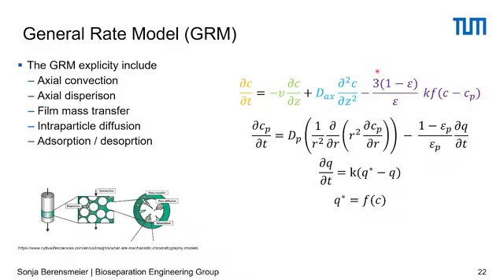So as you can already see, we have a small modifier to our general mobile phase equation, and this is due to the mass transfer. We have Kf, which is a mass transfer parameter, and we have this value 3, which comes from the particles being radial or spheres. And then we have a more complex equation describing all the effects happening inside of our pores. So we have the concentration of a molecule inside the pores over time, dependent on the diffusion coefficient inside our particles.